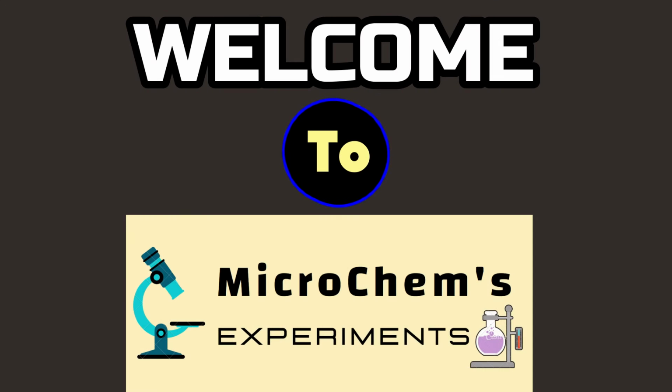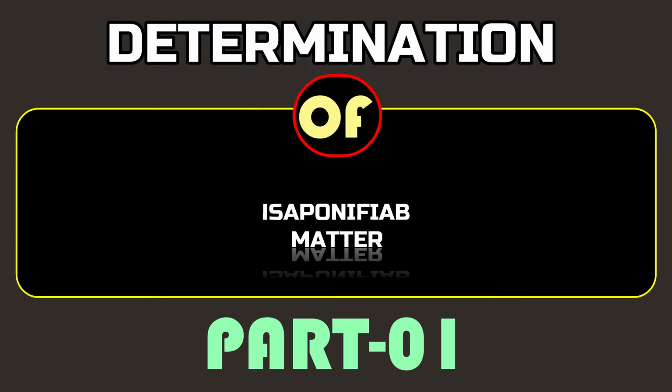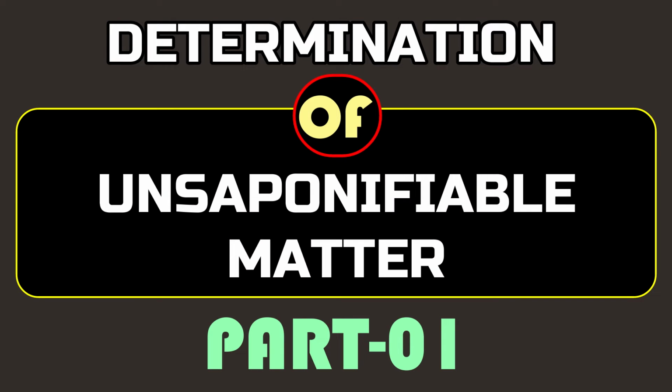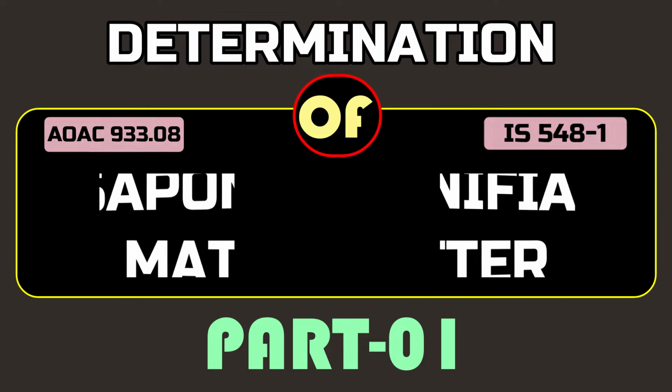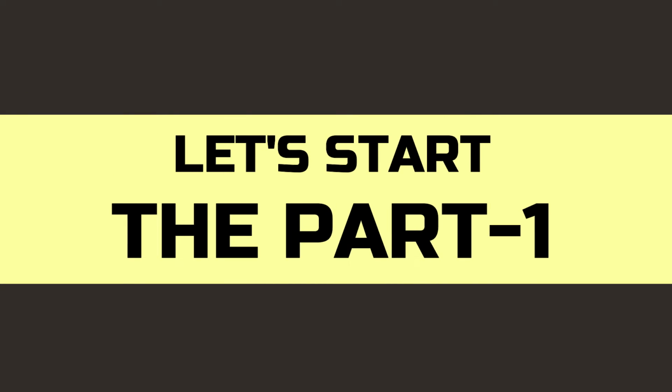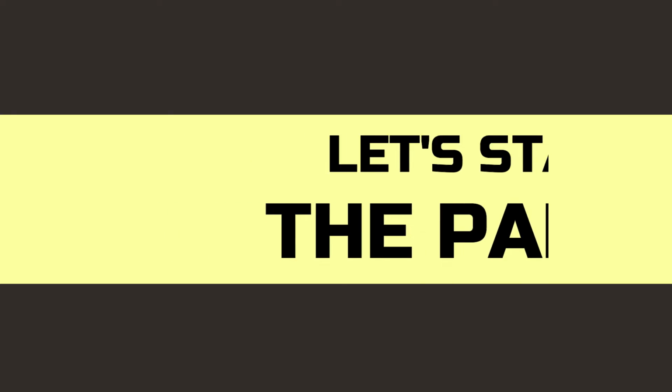Today we are going to present a very important test for oil and fat samples, which is the determination of unsaponifiable matter. This test procedure is relatively long, and that's why we divided the whole procedure into two parts to show the detailed procedure. Hence, the audience can achieve a better understanding of the test. Let's start our long journey of unsaponifiable matter determination.